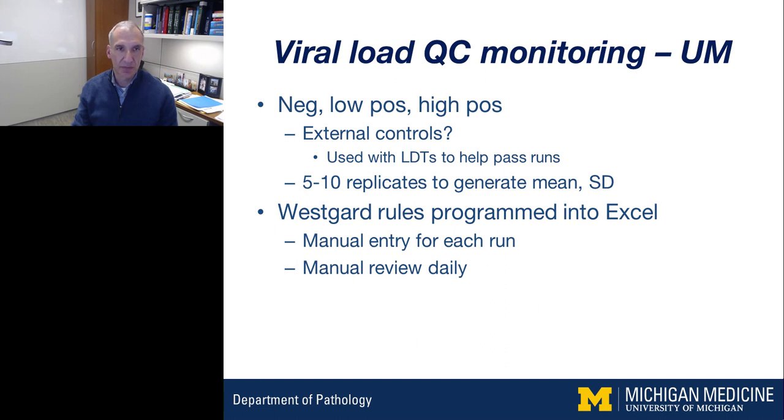The approach that we take is for our viral load assays, and in particular, we're going to talk mostly about HIV viral loads from our lab today. But in general, our assays have, for these quantitative tests, negative controls, low positive controls, and high positive controls. We historically had third-party external controls or in-house developed and external controls that were used in our laboratory developed tests as an extra run control. And really it was used to help us, because they were laboratory developed tests, have an extra level of control and help us pass our runs.